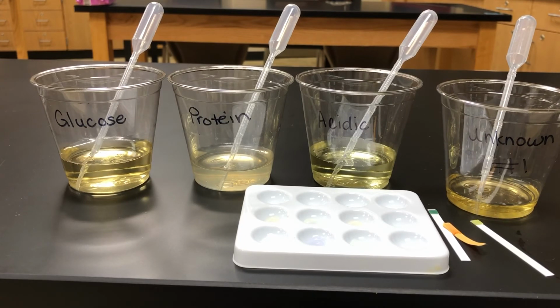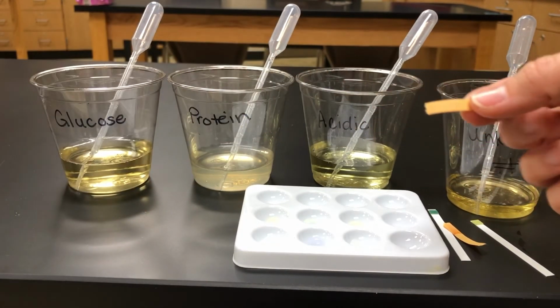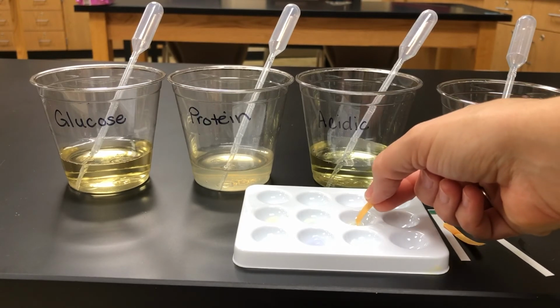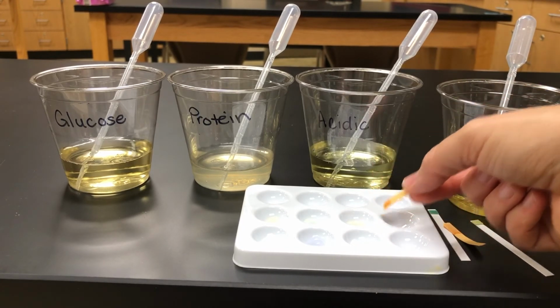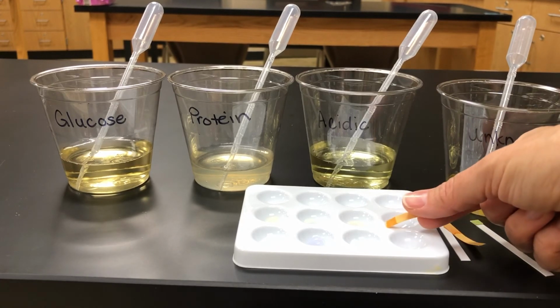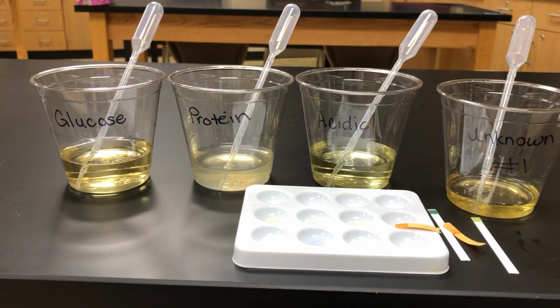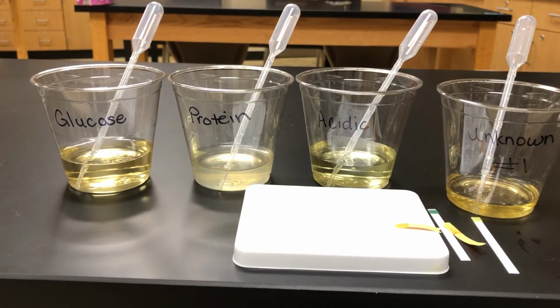Okay, lastly in part B, we need to test the acid. So we're going to take our pH paper again. Here's a strip of it, and we're going to place the tip of it in the solution. And we're going to let that sit for a couple of minutes, and then we'll record our results. I'm going to leave it right here so that we don't get them confused. Okay, so make sure that you're writing down your observations, and then is the substance present? Yes or no, and then we can work through the analysis questions on your own.